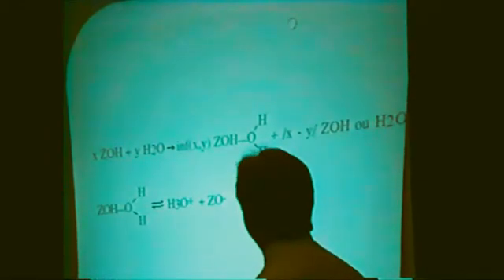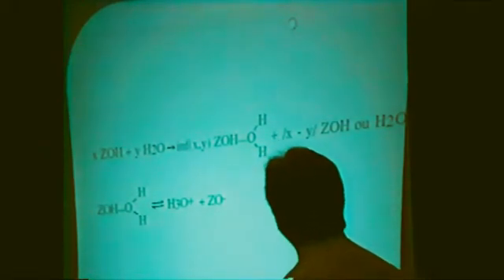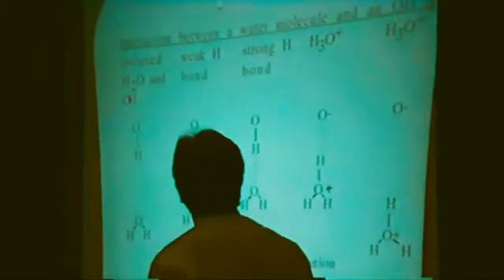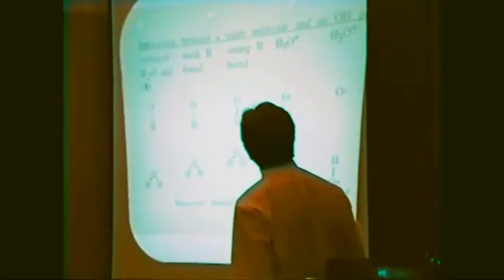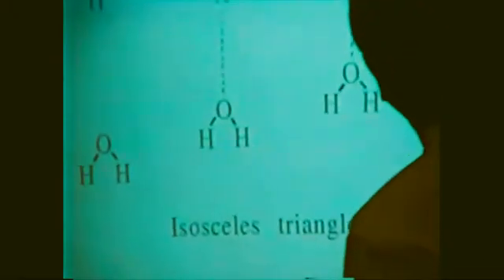And so we have to study such a reaction, that means OH group at the solid surface plus water. Either the OH groups are non-acidic at all, and so you must detect the OH group and water molecule without any interaction, or you have a low acidity and you may have a hydrogen bond, more or less important, or the solid is really very acidic and you must form a more or less large concentration of hydroxonium ion. And so it's necessary to find a spectroscopy able to detect these different interactions: no interaction at all, or formation of hydroxonium ion, more or less in strong interaction with the surface, and here, low hydrogen bond or strong hydrogen bond.